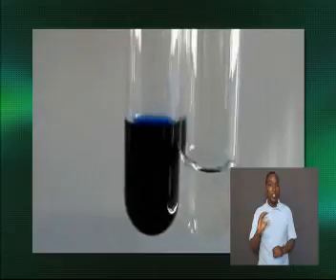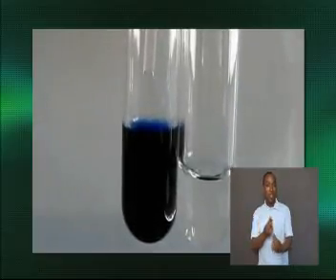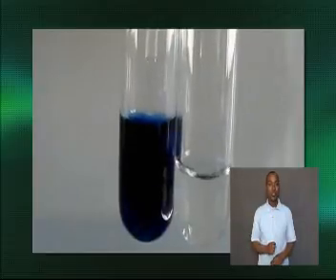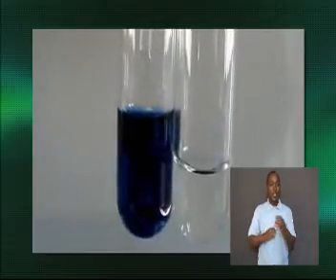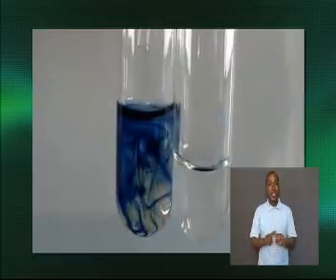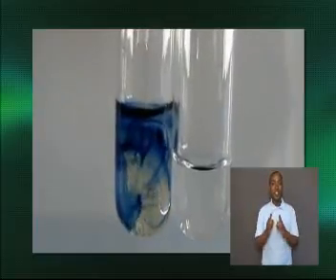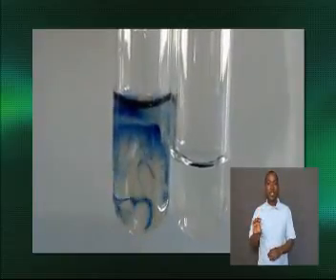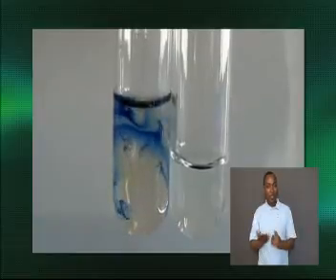Vitamin C and other nutrients like starch or glucose will combine chemically with the reagent. But the way in which the reagent combines with vitamin C will produce a substance with no color.